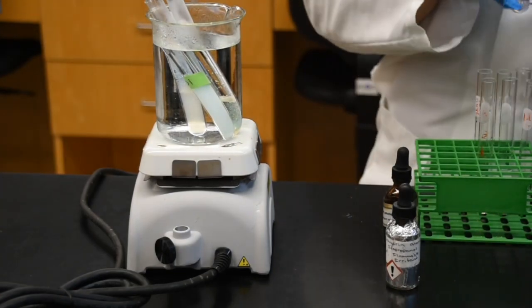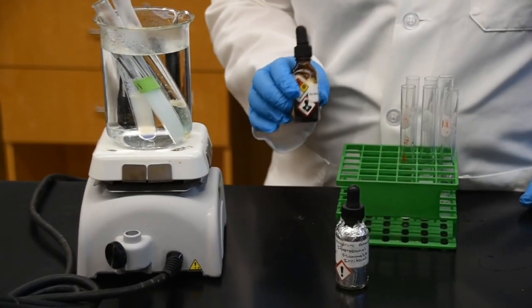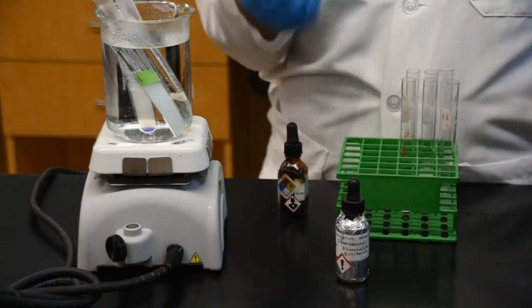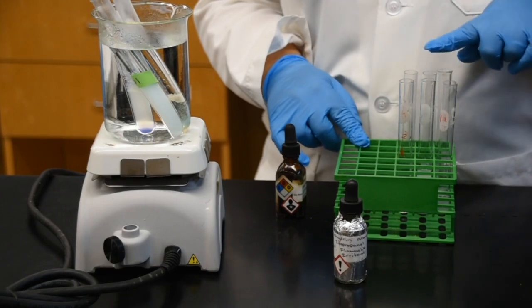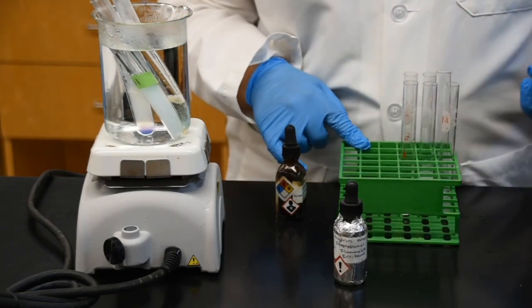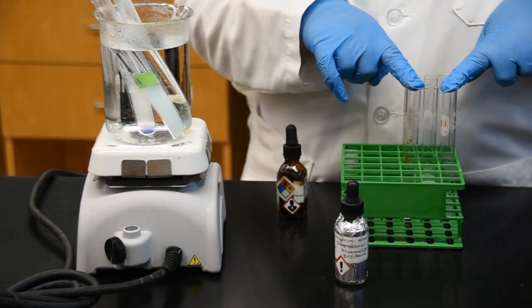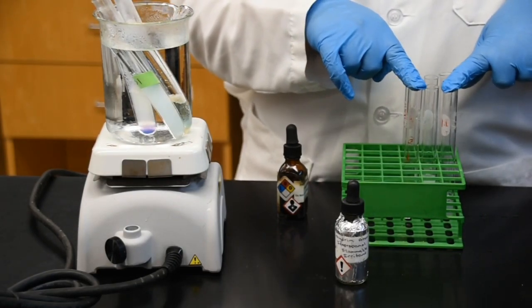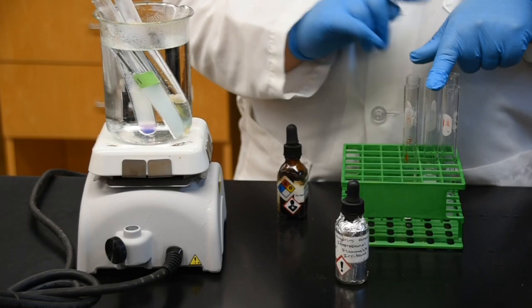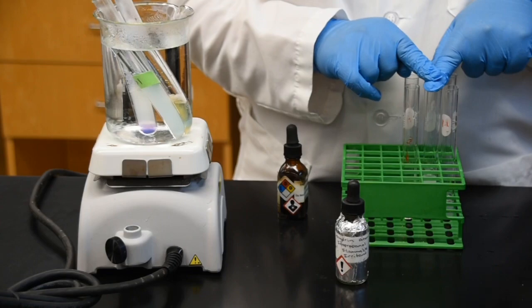Now, while we're waiting for this, I'm going to run the second test, which is the Lugol iodine. Again, Lugol iodine will be used to identify starch. So, same samples that we did here, we're going to repeat it. We have a solution of a protein, a solution of a starch, and a solution of simple sugar. So what I expect to see, if my prediction is correct, is that the protein and simple sugar will stay yellow because the indicator Lugol does not identify anything. However, when I add it to my starch tube, the Lugol iodine will interact with it and, as a result, it will be identified.